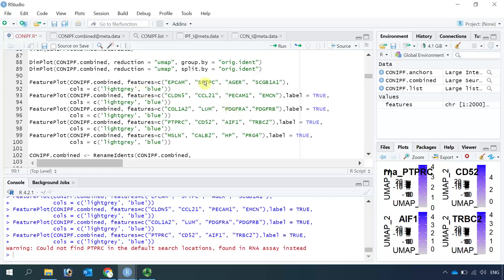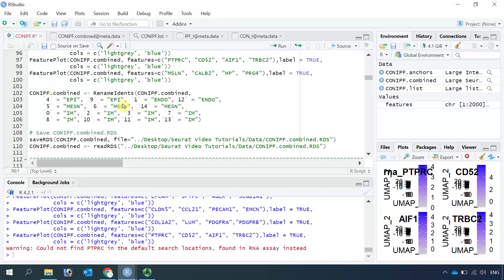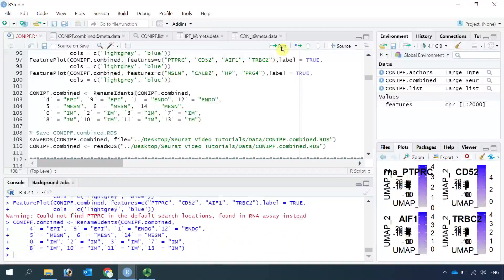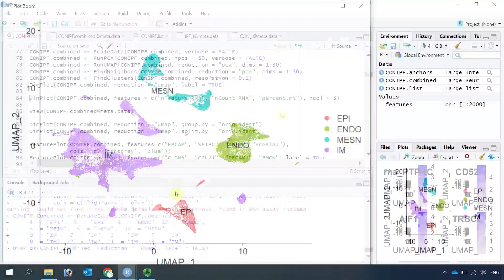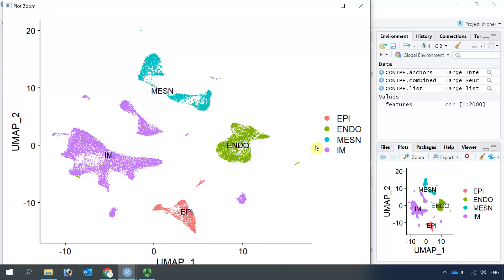I am analyzing single-cell RNA sequencing data for lung tissue, so I know these marker genes well. When you analyze your own data, you need to find the best markers for your cell types. Now we can name the cell clusters simply as epithelial cells, endothelial cells, mesenchymal cells, and immune cells. Going back to the DimPlot, you can now see we have named the four types of cells in the lung tissue: immune cells, mesenchymal cells, endothelial cells, and epithelial cells.